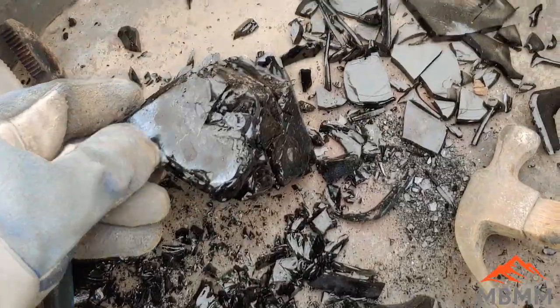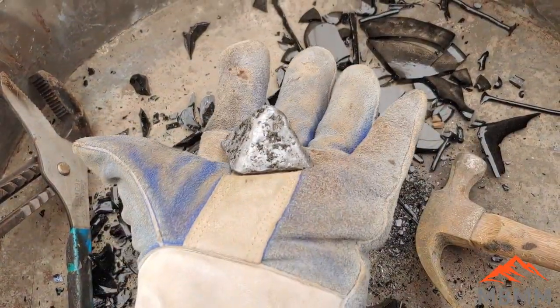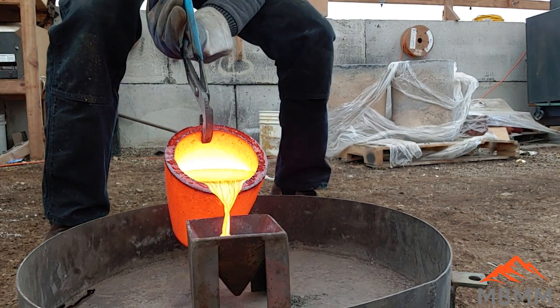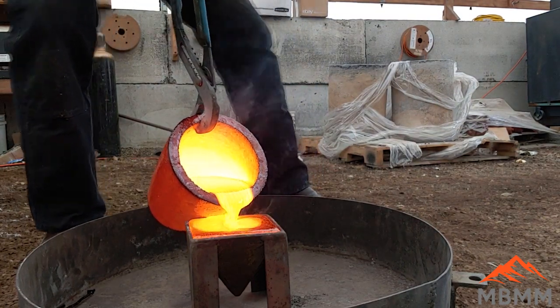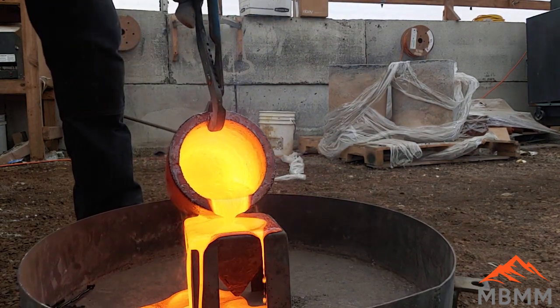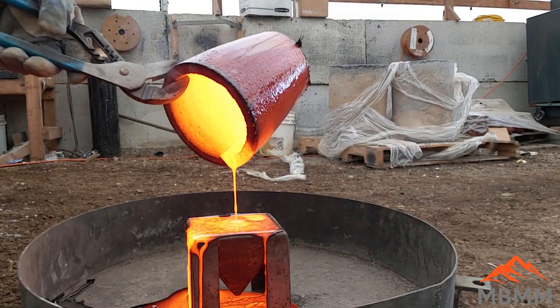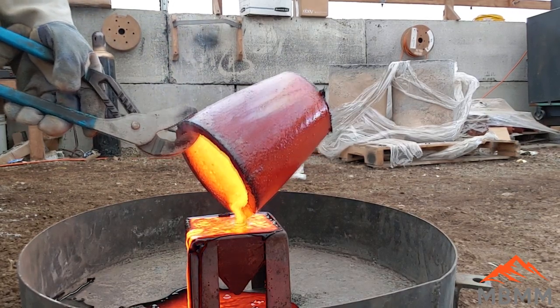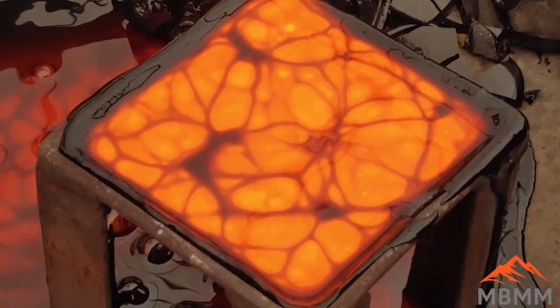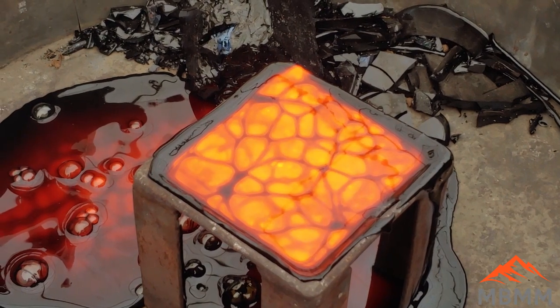Here I'm showing that we didn't have any matte layer — it's just glassy slag and our nice lead button. We'll take this and cupell it to recover the precious metals.